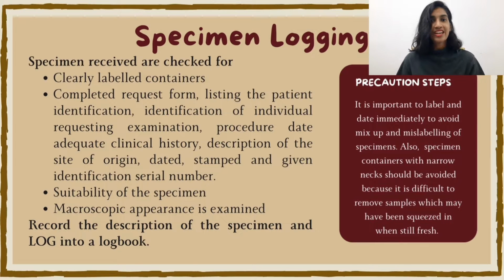in the slides. They are first cross-checked for the suitability of histological examination. The description of the specimen, such as the examination of the specimen, weight, measurement, and also consistency, is also recorded, and all difficulties such as improper receiving of specimens, mislabeled specimens, and other issues that hold up specimen processing may be avoided by following the standard operating procedure.